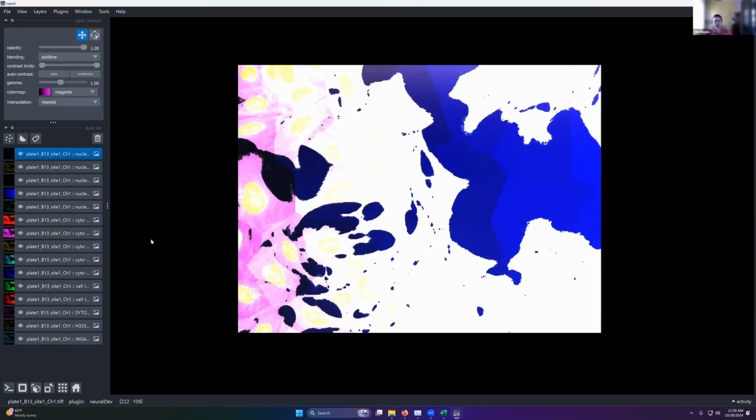That just appeared on the most recent version, 0.5.4, but my most recent version of the plugin is also the first one to contain an image reader. It used to depend on Napari AICS image, but if you're familiar with AICS image IO, it's the best way, I think, to handle most microscopy data in Python. It now has bio-IO support, or bio-IO is kind of the replacement of that, which I think works better. So anyone running into any issues or anything?